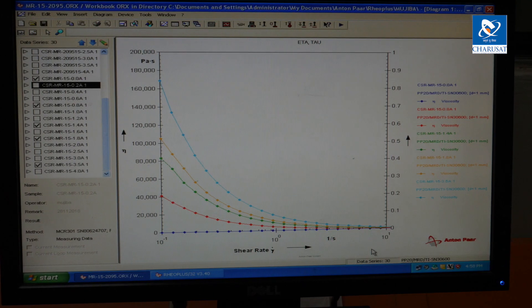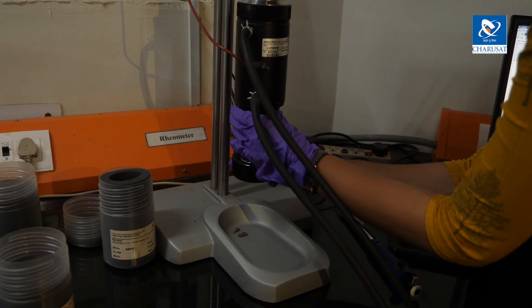Temperature dependent viscosity measurements are also possible, from room temperature to 60 degrees Celsius. Students can learn flow properties of different materials using this instrument, and how these properties vary with shear rate and with temperature. Students can learn independent handling of the instrument, which will be useful for future R&D activities, and it will also open job opportunities at industries like paint, food, and petrochemical industries.